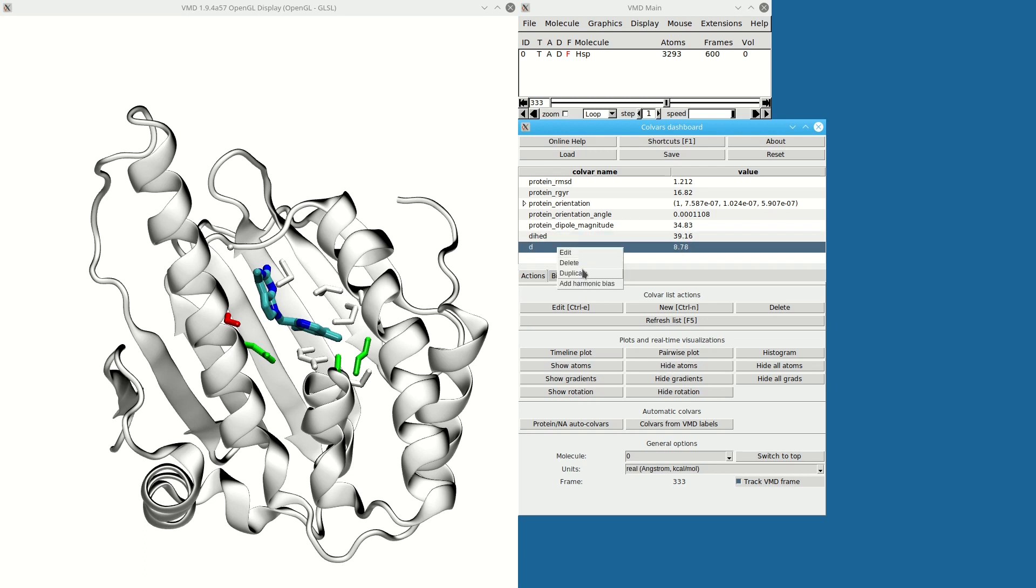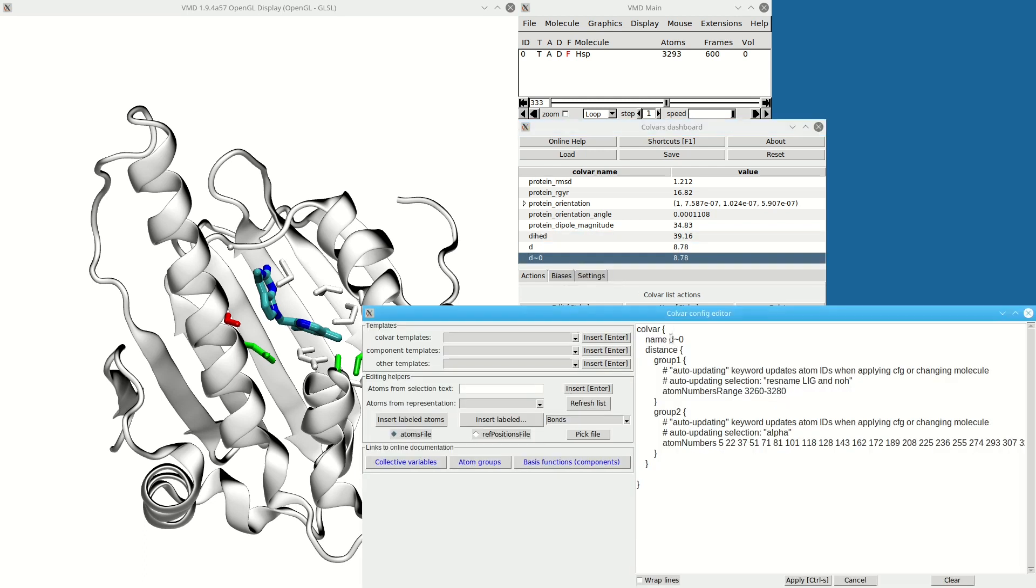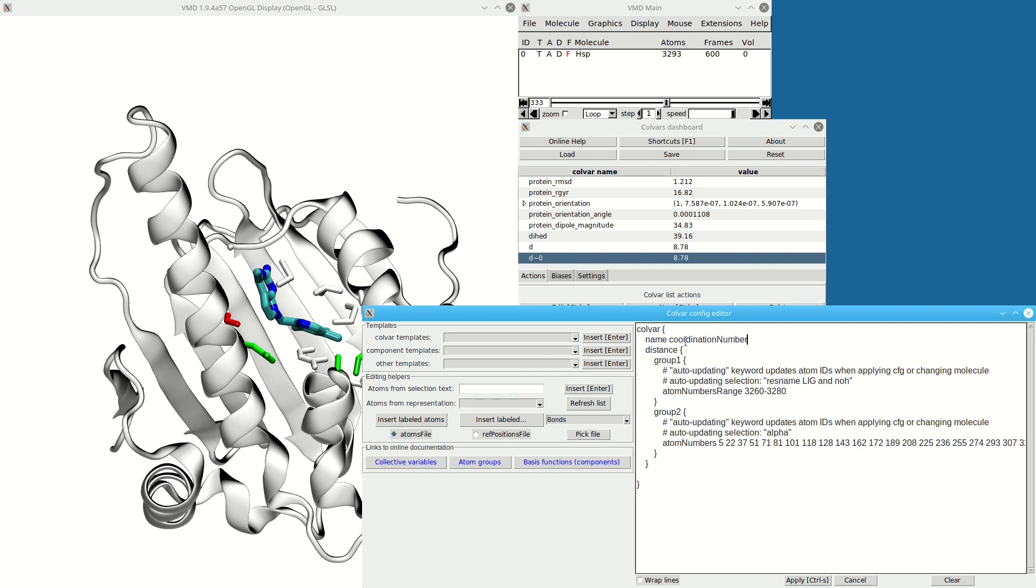Now let me create a variant of the distance. Instead of the distance, say I want to look at the coordination number between the ligand and the protein. So I'm going to rename this and replace the distance keyword with coordNum.